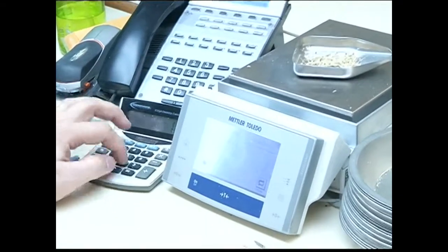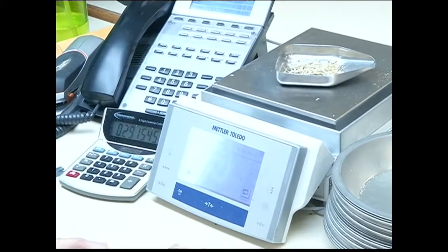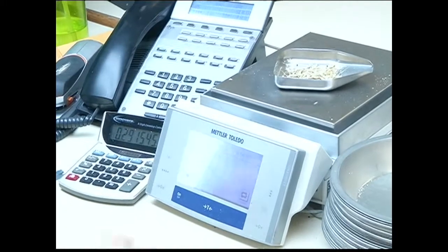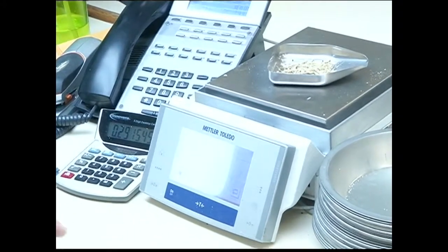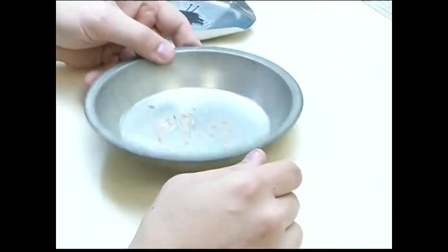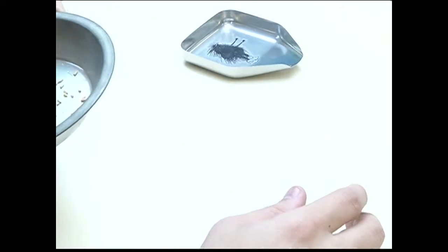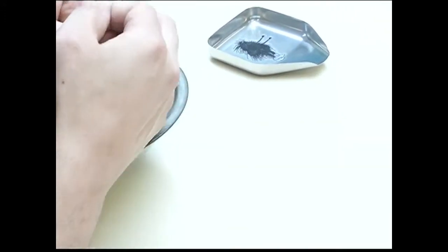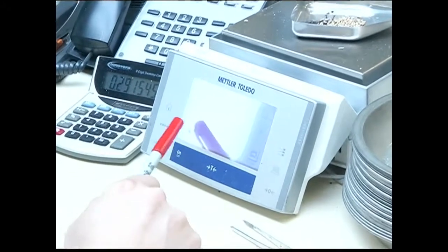Do my math facts here, and that'll give me a percentage of dockage within my 1,000 gram portion, which is that represented portion of the rail car, the bin, the farmer sample, whatever they wanted to bring in. Then I look at my shrunken and broken. That is what the last step Jeff did at the sieve there. This is what was pulled out of a 250 gram portion. I also look in there for stones, see if there's any stones in there that looks like dirt clumps. Any rodent pellets in there I keep an eye out for.